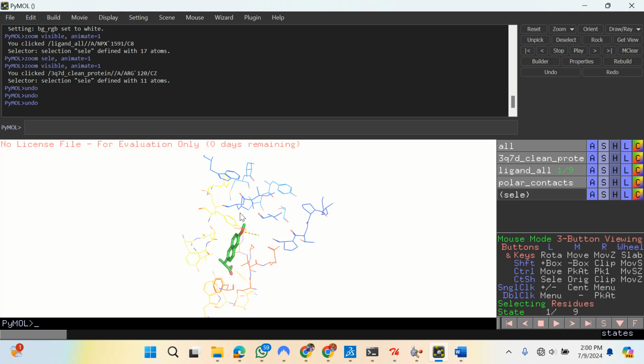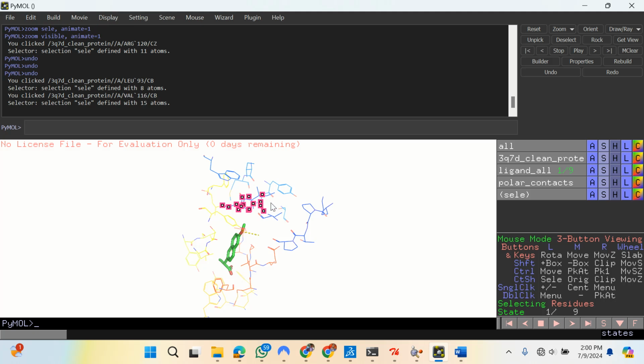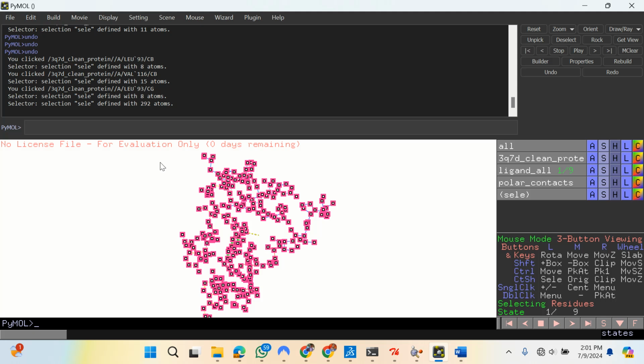Okay. So you can select them one after the other. However, when you click outside, they will disappear. You will now come and start highlighting again. But if you are highlighting and you are holding down the shift button, even if you click outside, it won't disappear. So you could also hold down the shift button and double click and highlight everything at once. Yes.